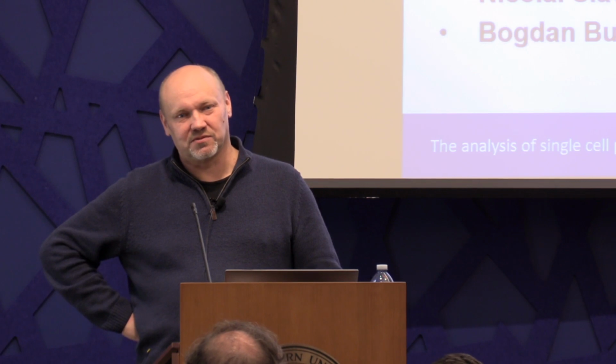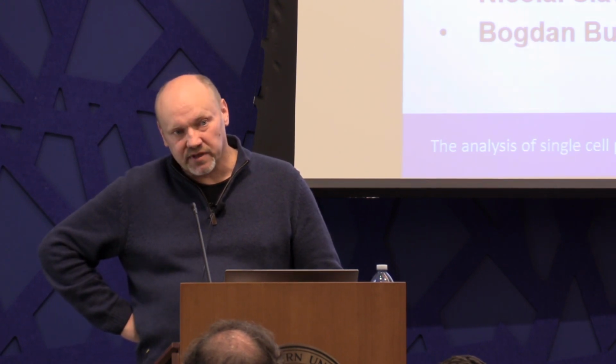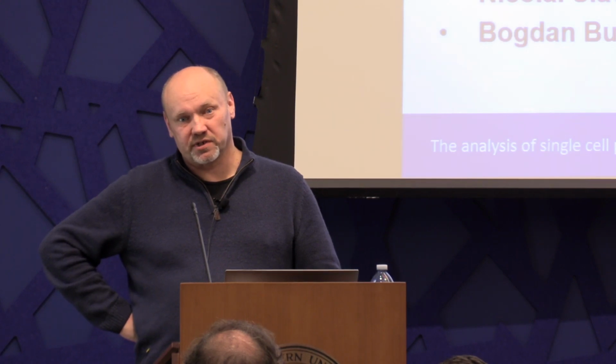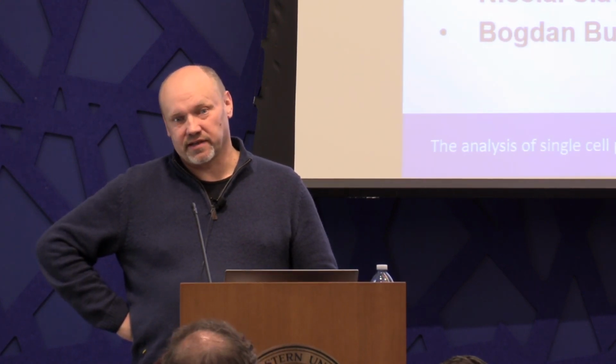Okay. And I guess because you mentioned modified phosphorylation, the learning data set is not so big there. That might be a bit of a problem because you don't have 1.4 million unique peptides, but probably a much lower number. Yeah, phosphorylation is not so bad, I would say, but if you go to other PTMs, then of course that might become an issue. But then the way to go might be also to use Winner, because Winner, being conventional machine learning, needs fewer training examples.